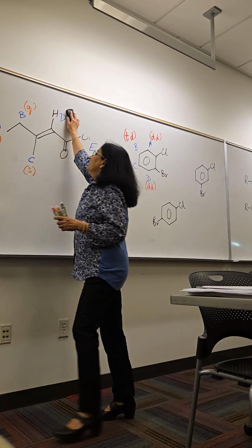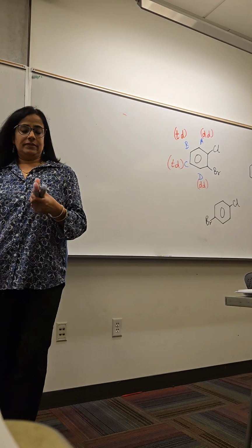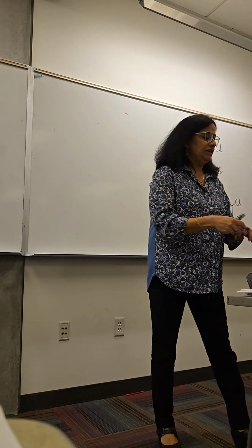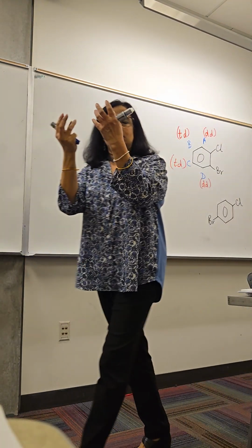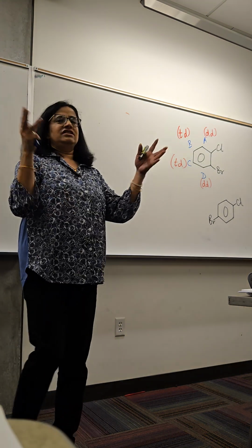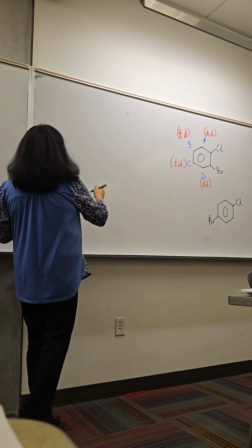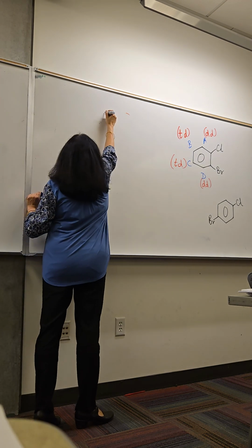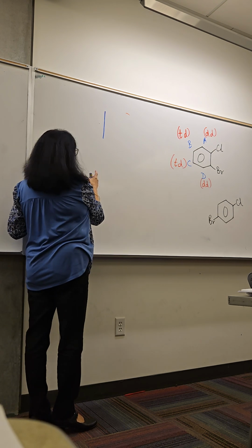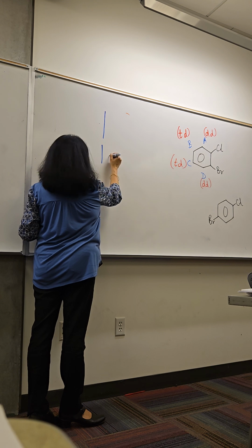I can try. Okay. Ideally speaking, that depends on the compound and the instrument's resolution. If you were doing it upstairs, you would just see a blob, but if you had a decent instrument. So first this is your signal. And that signal gets split into a triplet first, keeping the chemical shift the same.